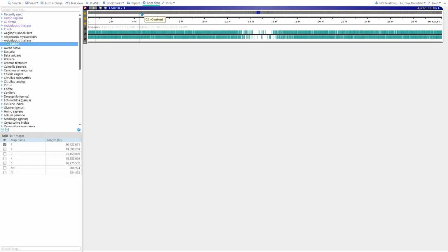The first one is the sequence track. At this resolution, it has the form of a GC content histogram. The poly-N regions are shown in blue, then the ruler and the track with gene models in two orientations, in the positive and the negative strands.